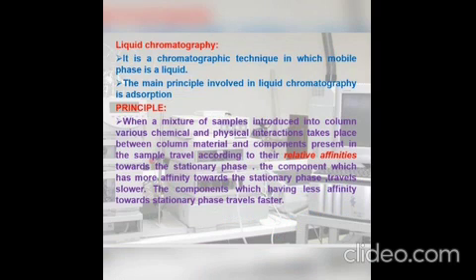Liquid chromatography is a technique in which the mobile phase is a liquid. If we use a gas as the mobile phase, it is known as gas chromatography. The main principle involved in liquid chromatography is adsorption.